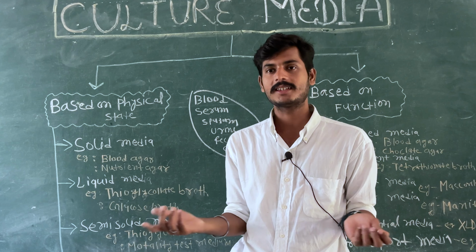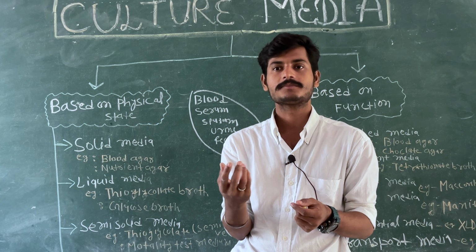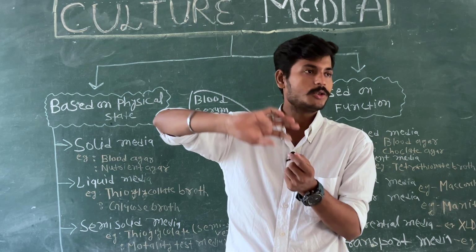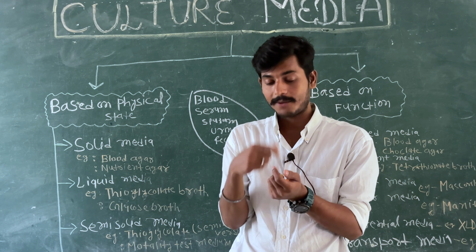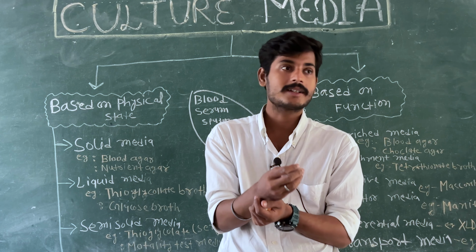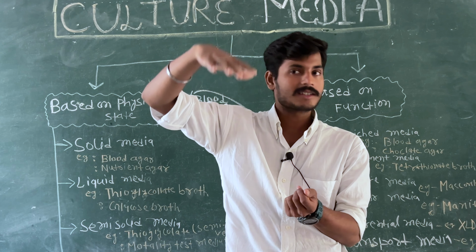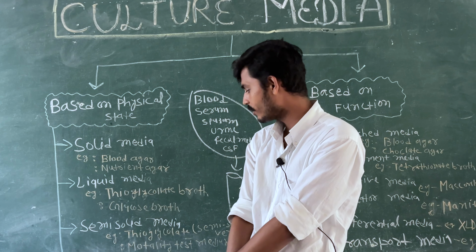thioglycollate broth. It is nothing, एक ट्यूब लेते हैं, ट्यूब के अंदर में हम लोग क्या करते हैं, तो कुछ केमिकल्स मिलाते हैं, और केमिकल मिलाने के कारण क्या होता है, तो ट्यूब में जितना भी ऑक्सीजन रहता है वो सारा गायब हो जाता है, उसके अंदर में हम उसके बाद उस बैक्टीरिया को रखते हैं. बैक्टीरिया के रखने के बाद जो बैक्टीरिया एरोबिक बैक्टीरिया होगा वो ऊपर में ग्रो करेगा, जो एनारोबिक बैक्टीरिया सब होगा वो नीचे ग्रो करता हुआ जाएगा. दैट इज कॉल्ड एज द thioglycollate broth.